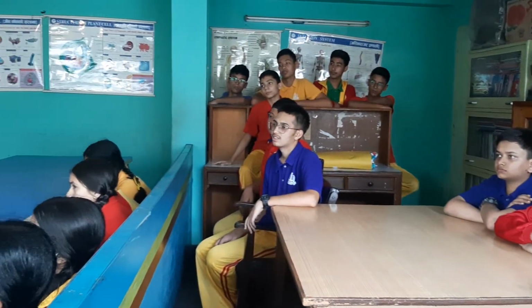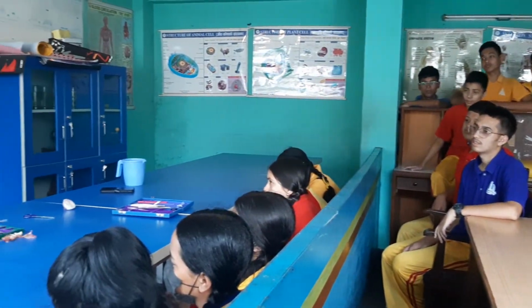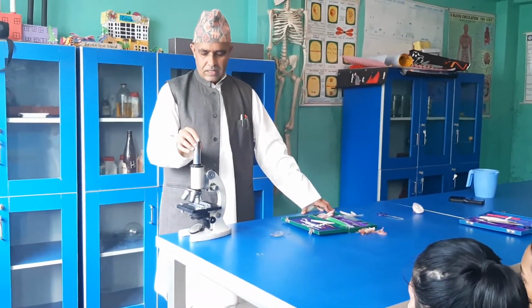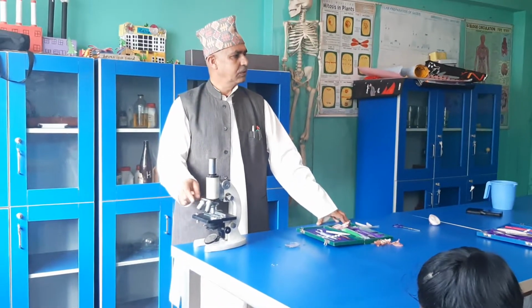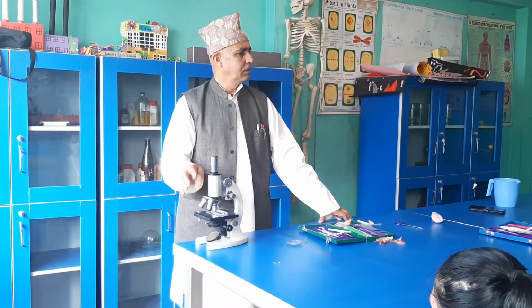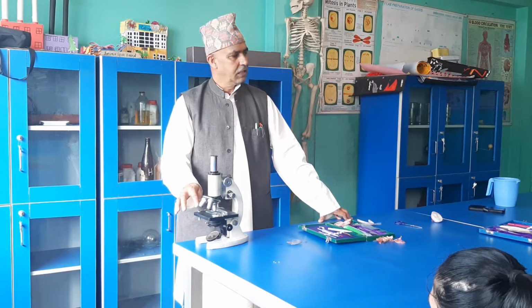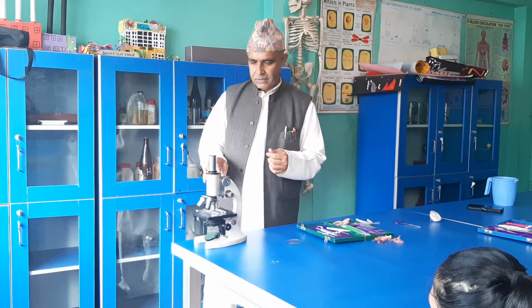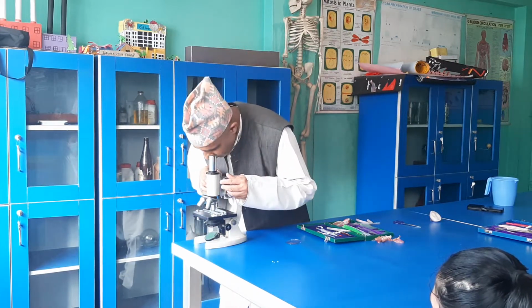And I have already said, this microscope can multiply a maximum of 250 times. How many times? Why? Because the eyepiece is 10x, and here are three objectives. One is 10, 15, 25. 10 means 10 tens are 100 times. If you give 15, 15 tens are 150, and 25 tens are 250. Okay.